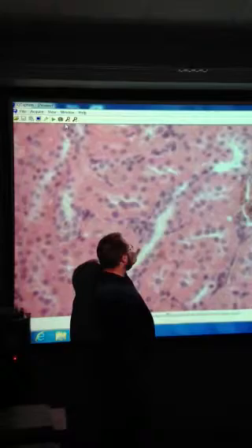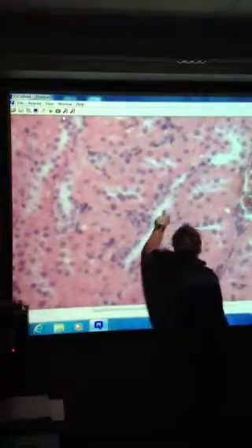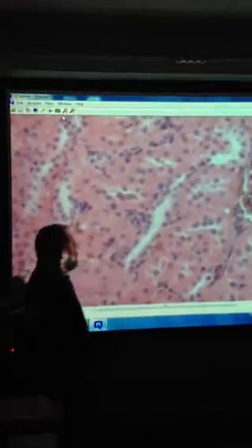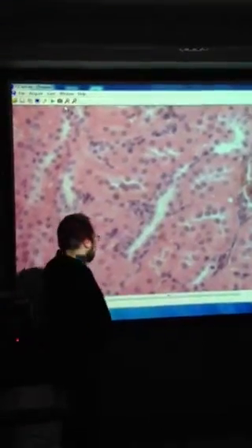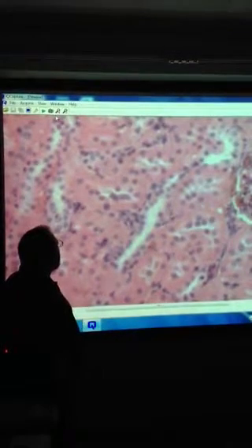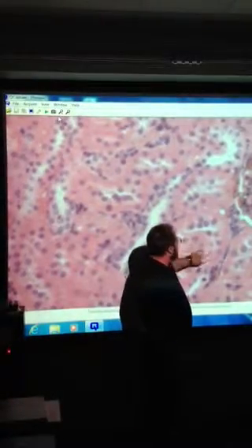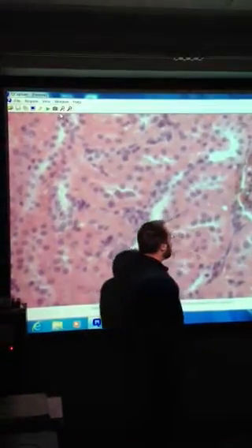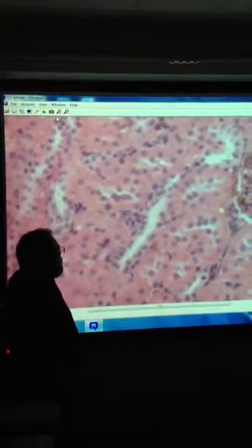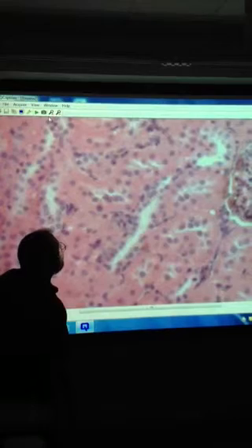See how close these nuclei are to the surface though? I think that that's a continuation of this one. So I think that that's to the nuclei closer to the edge. Yeah. They'll also pick up different stains. Notice how these cells have a different color than these. So I think that these are all proximal. Yeah, it's kind of hard to tell.